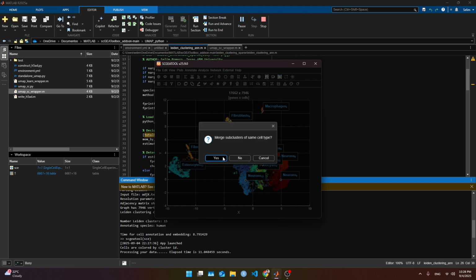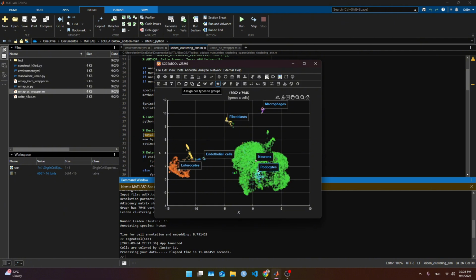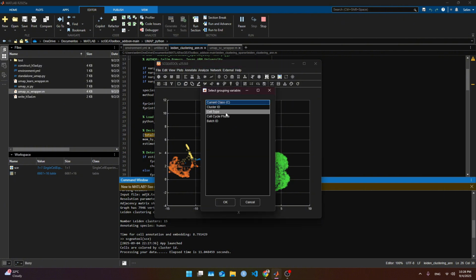All right, this case looks very similar. It is prior knowledge I have that some cancer cells behave like neurons, but still we need to look at markers and be very careful how we classify those. Right now, I think we can take out the neurons. Those are not neuron cells, but are classified as that. We have to figure out what those are, but we can work with that meanwhile.